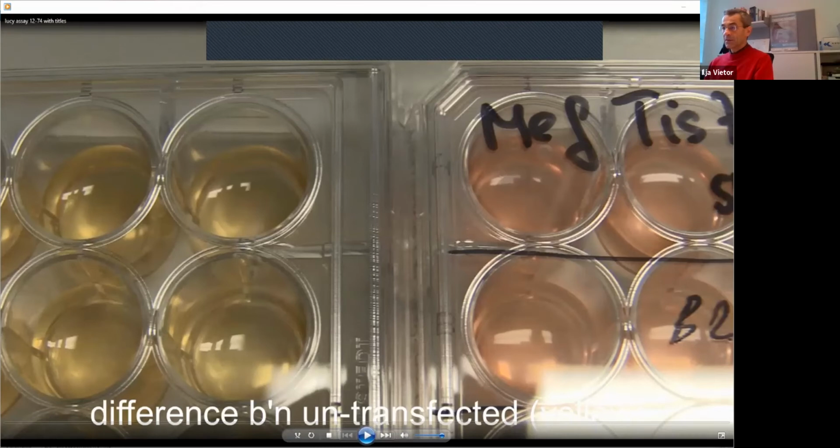Yellow color means that cells are growing fast. They are certainly overgrown. This pinkish red color is that it's alkalic, meaning that they are not so fastly growing. So there is an effect of the transfection. Something happened with the cells.